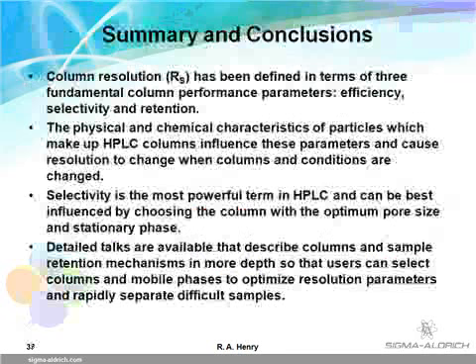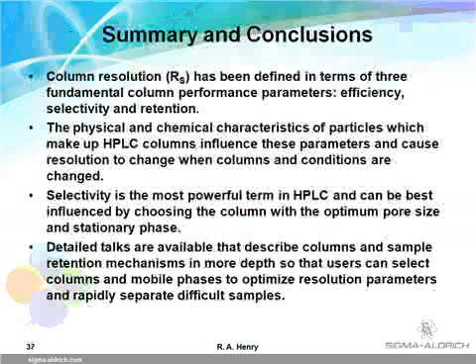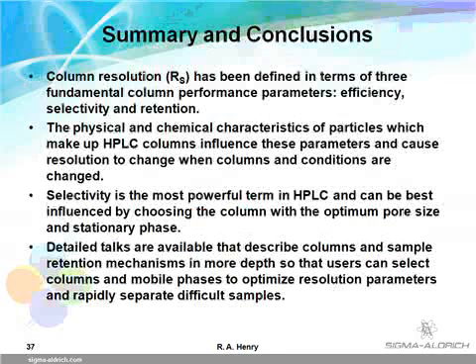In our summary slide, this seminar has provided an introduction to column terms of efficiency, retention, and selectivity that make up the fundamental resolution equation. Some particle characteristics that affect these terms have been described, and a brief introduction to HPLC phase chemistry and separation development has been included. We recommend other Sigma-Aldrich Supelco seminars that go into more detail on separation mechanisms, column selection, and method development.